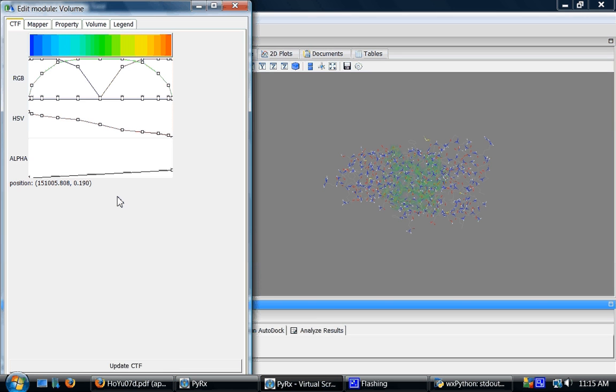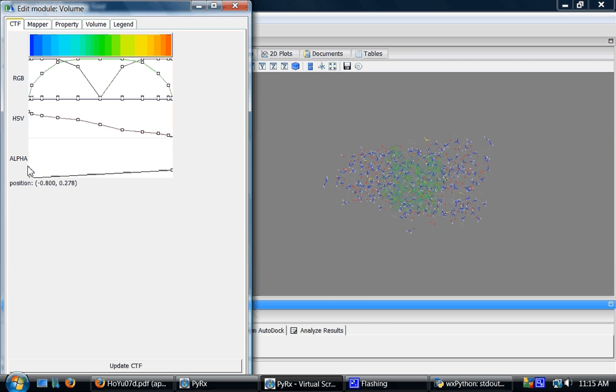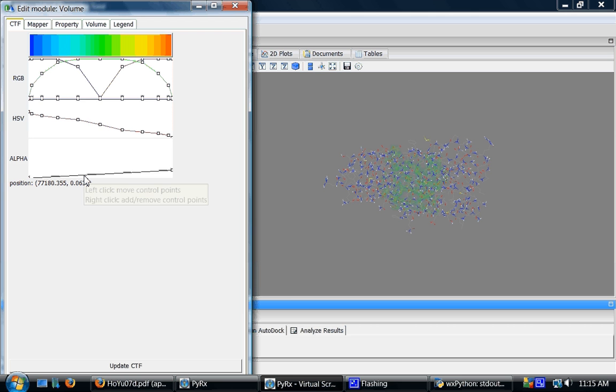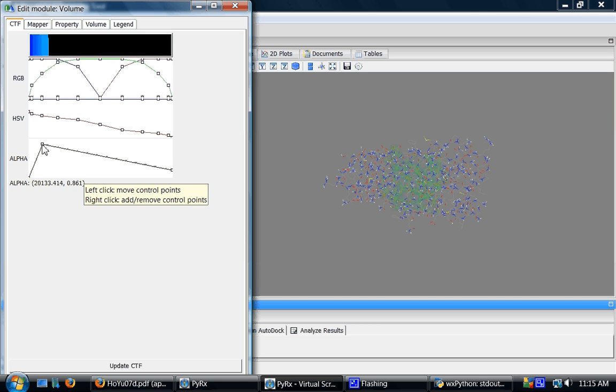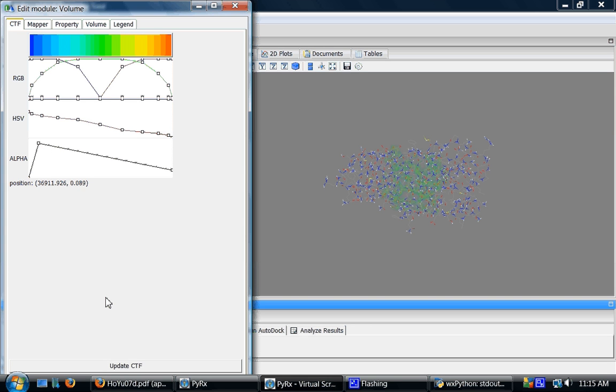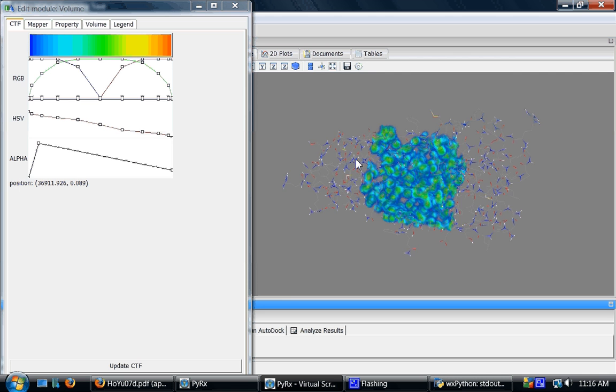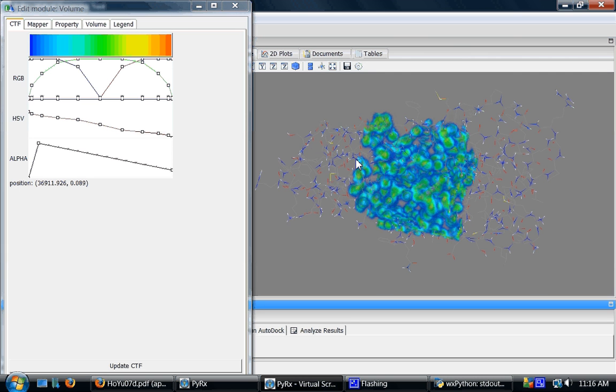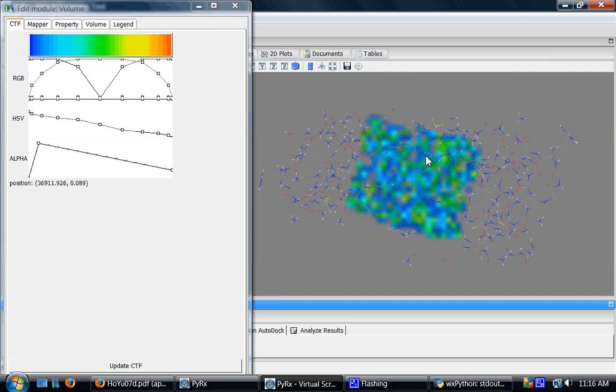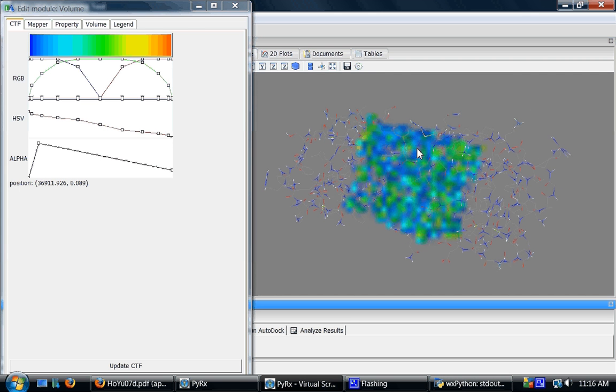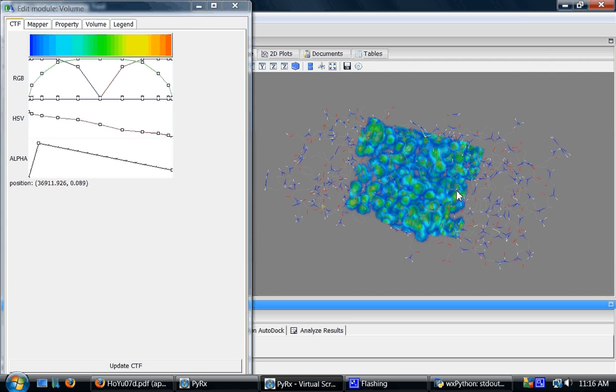Here one of the interesting plots is this alpha versus position. Alpha is the transparency and position in this case is the carbon atom energies. I'll right click on this curve and move this here and click update. And this will show a very nice interesting volume rendering of the AutoGrid maps.